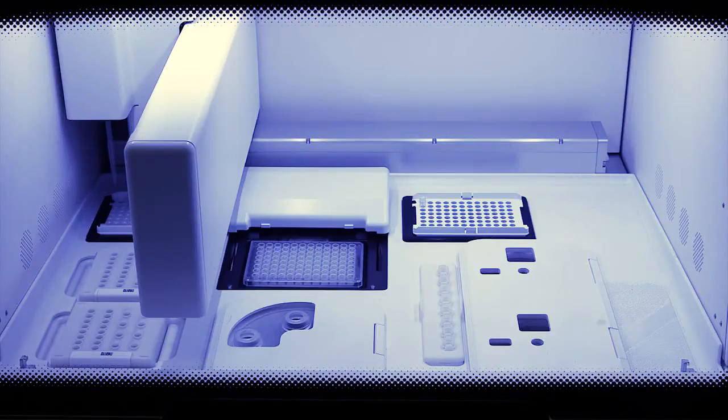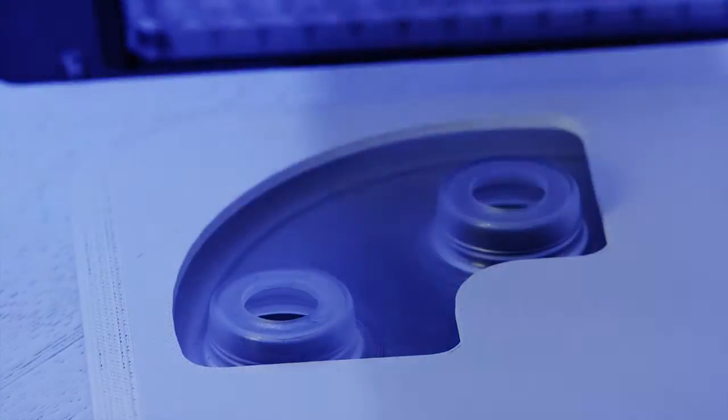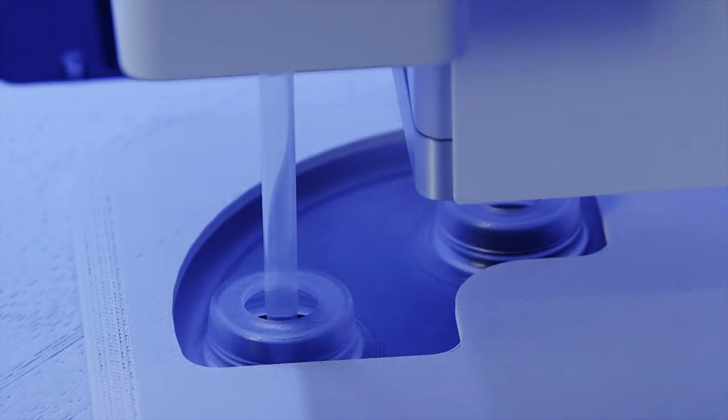ISPs are recovered and template positive particles are separated at the enrichment station. Finally, the templated ISPs are loaded onto the chips.